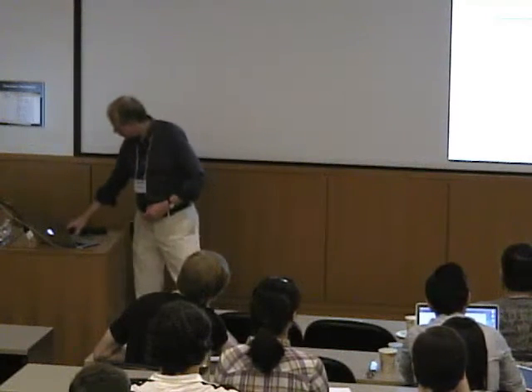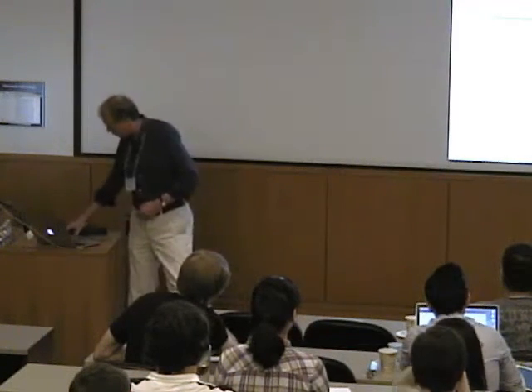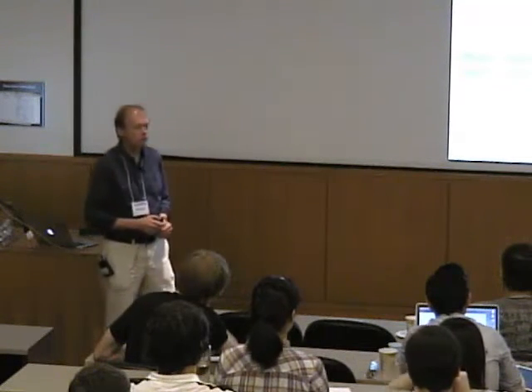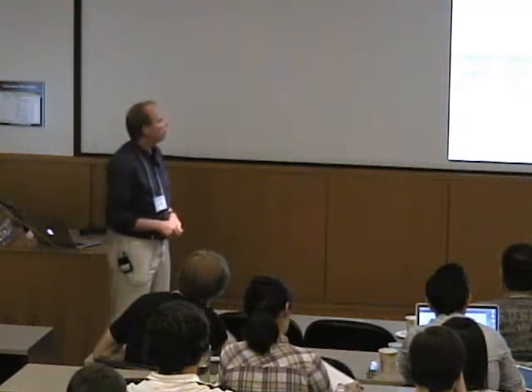Does that hurt your sample when you're playing? Like when you're making that decision about that opening, does it affect the sample such that you have to start over again? I see. Yeah. So the question is, if I'm adjusting this, does that have any effect on the sample, right? The waves will be coming in, and does that irradiation have any effect on the sample? Of course, the microwaves coming in will be absorbed by the sample, but the energy involved in EPR transitions is very, very low. And so this really does not have any substantial effect on the sample, right?